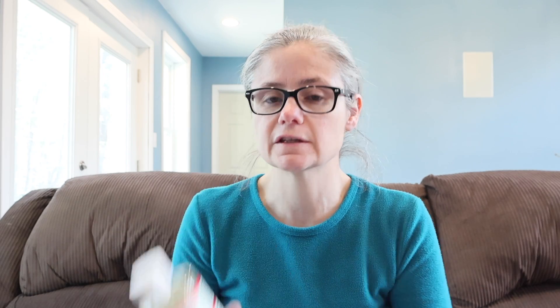Now, nowhere on their website — they have a really nice website by the way, so if you haven't been to it, you really should go to it. Lots of different cleaning ideas and nice cheat sheets for the dilutions. But nowhere on the website and nowhere on this bottle could I find any claims that Sal Suds is a disinfectant, a sanitizer, or can remove bacteria. But today we're going to test to see if it can remove bacteria, because that's what I do on this channel.